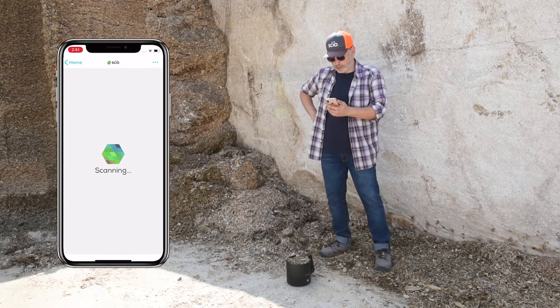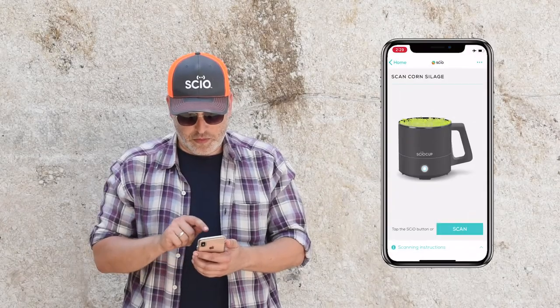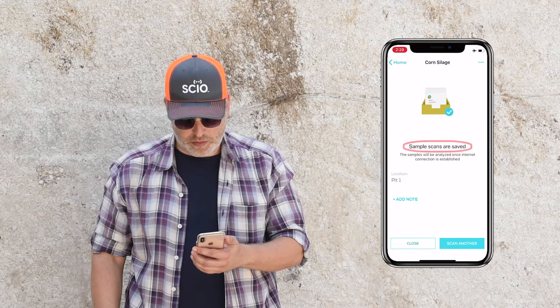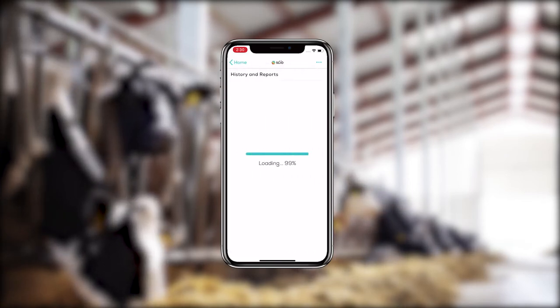You'll get the results in the app within a few seconds. If internet connection is not available, don't worry. You can still click to measure silage and you will get the dry matter results as soon as the internet is back. Simply click on History and Reports to see the results for that pit location.